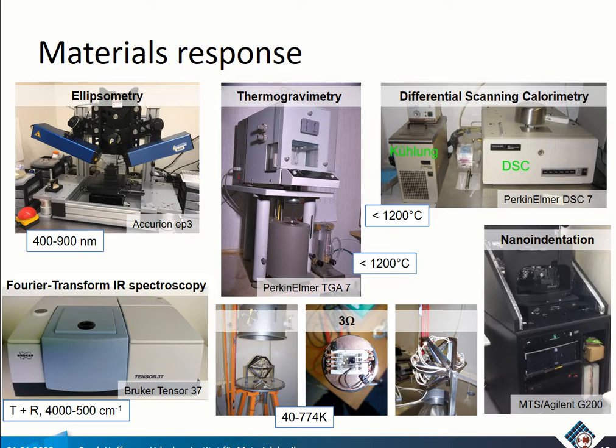Some materials characterization machines are listed here. Here we only have the most important machines. Of course, we have also other facilities like ovens or light microscopes or scales. So we have everything to manufacture the targets for the sputtering and the PLD systems ourselves. We're doing that especially for the complex oxides.